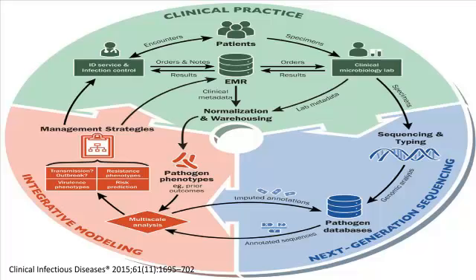Just briefly, Doug and Ben have talked about this: the process that samples go through. Patients or pigs come in, and data about that case is entered into the laboratory information system. We need to know a lot about what's normal, what we have out there, and what's available for comparison, and this strongly influences how we can apply importance to those specific pathogens.